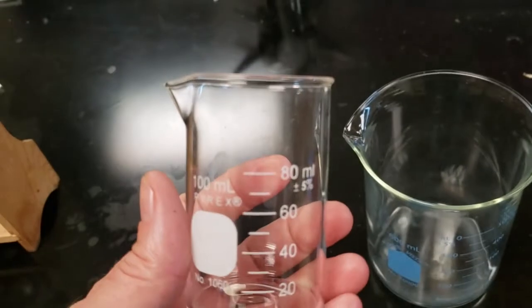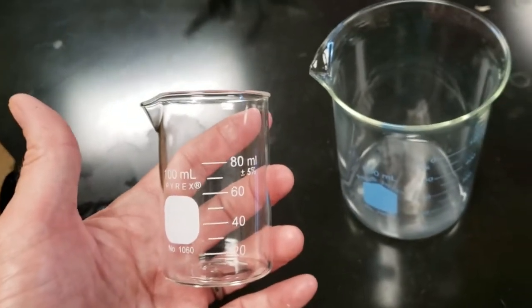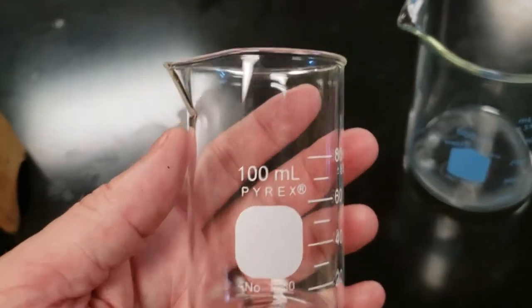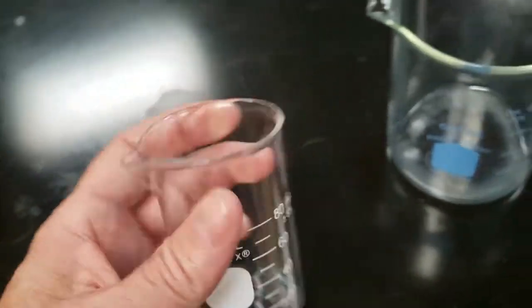People always like to make solutions in them and think they're very precise, but they're not. This one measures 100 mils, even though it only shows 80 on the right side. That's the way the beakers typically work. So it says 100 here, but it only measures up to 80 because there's room at the top. It does say it's plus or minus 5%, which would be 5 milliliters.